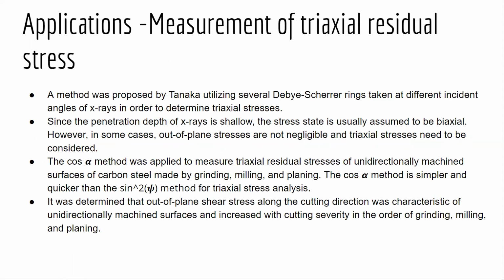One last application is in measurement of triaxial residual stress. A method was proposed by Tanaka utilizing several Debye rings taken at different incident angles of X-rays in order to determine triaxial stresses. Since the penetration depth of X-rays is shallow, the stress state is usually assumed to be biaxial. However, in some cases, out-of-plane stresses are not negligible, and triaxial stresses need to be considered.